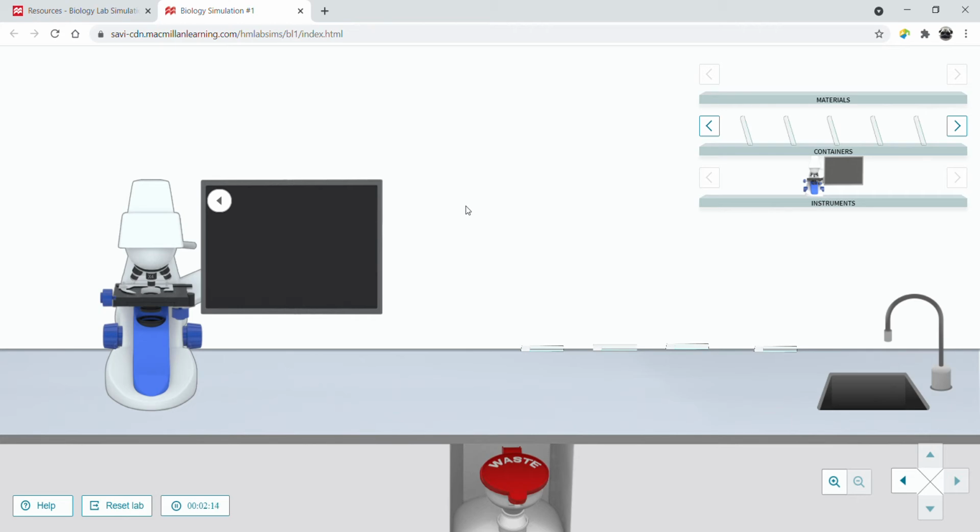This is a little bit challenging in a virtual setting. In a real-life situation, you will absolutely be asked to handle a real microscope, but the simulation does its best to try to repeat that experience. So go ahead and take a look at your handout.